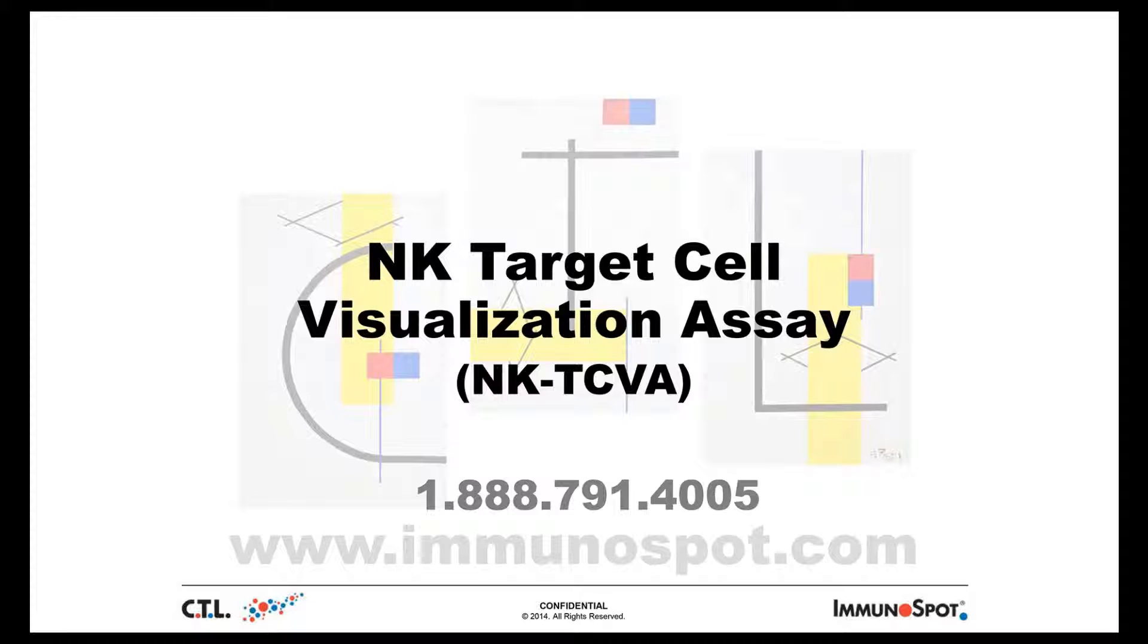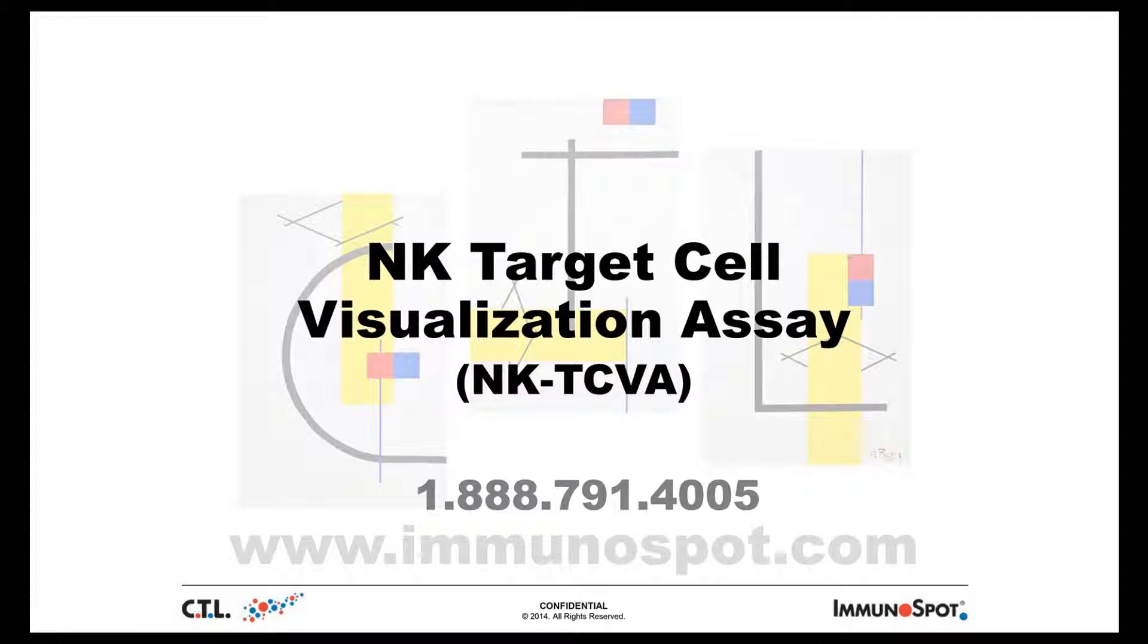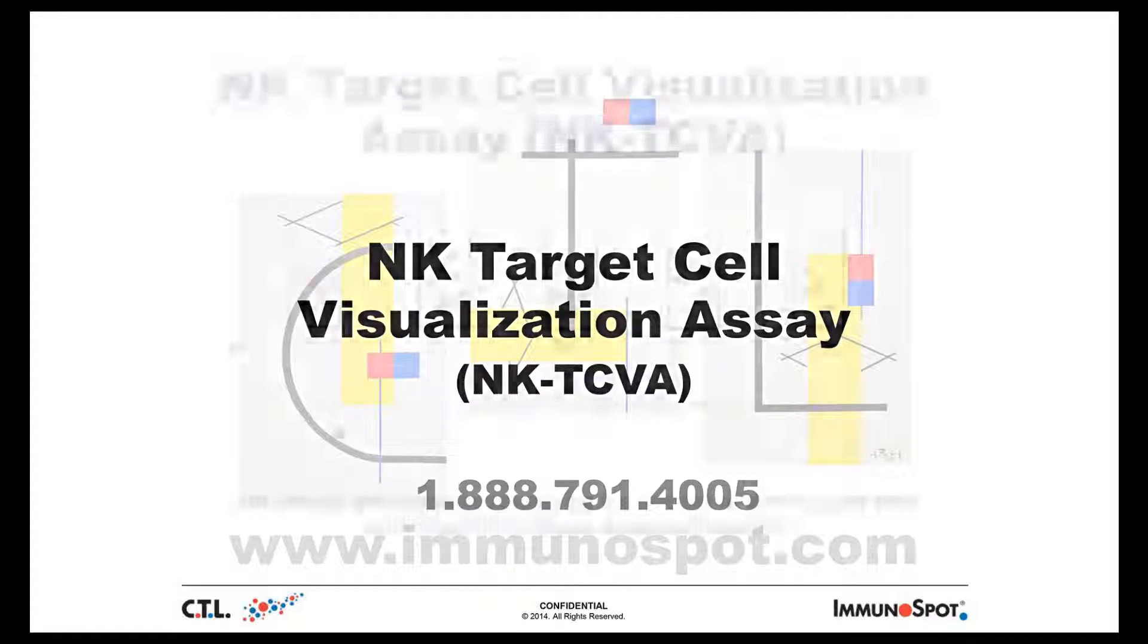The NKTCVA or target cell visualization assay detects the lysis of tumor cells by natural killer cells in a non-radioactive fashion where scanning, counting, and analysis is automated, thereby eliminating any subjectivity in the process. The NKTCVA reagent kit includes the target cell dye and the plates required to perform the lysis experiments.